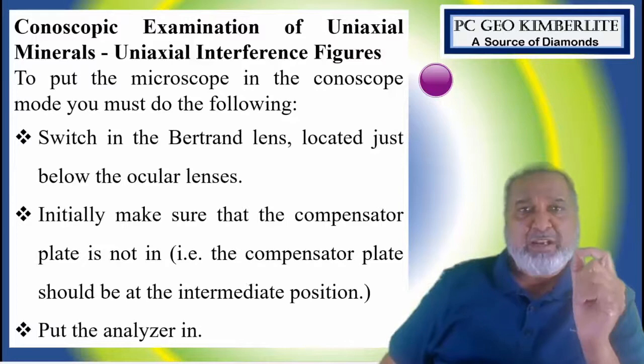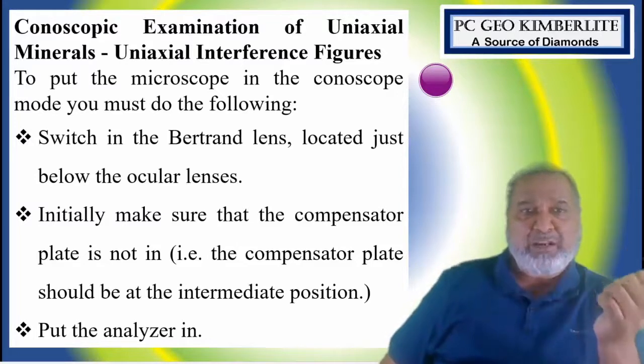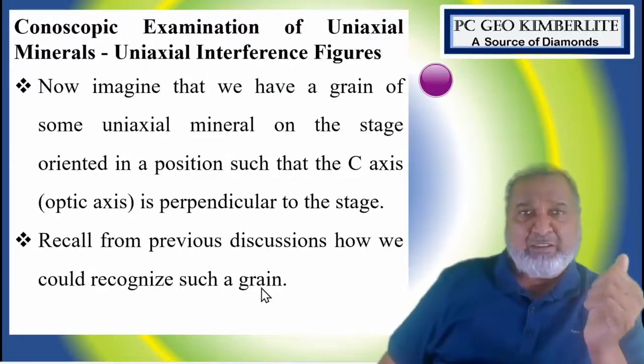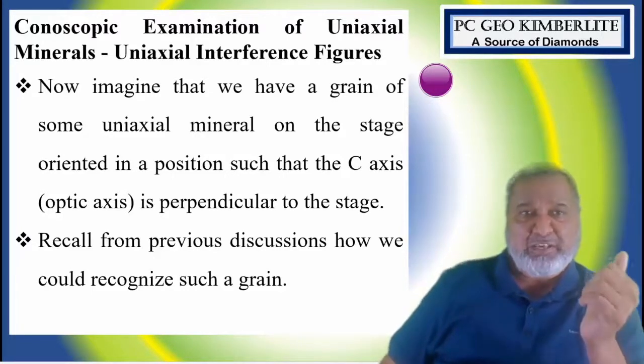Switch in the Bertrand lens located just below the ocular lens. Initially, make sure that the compensator plate is not in. The compensator plate should be in an intermediate position. Put the analyzer in.